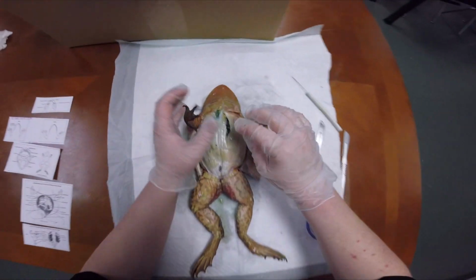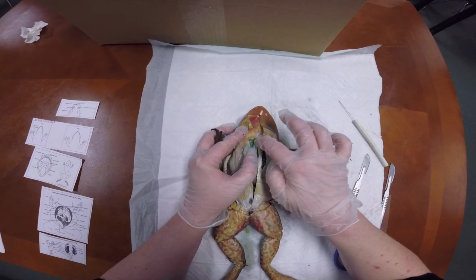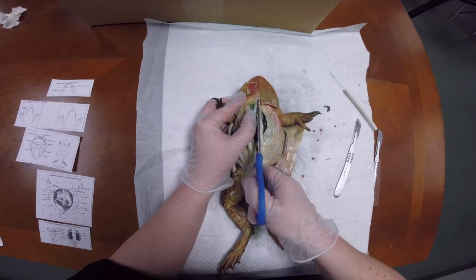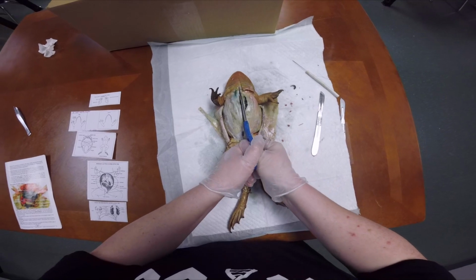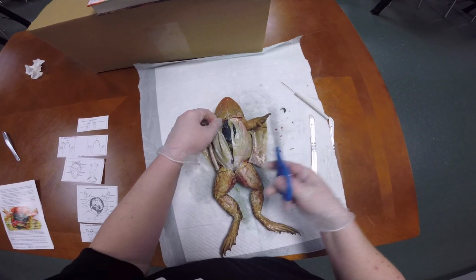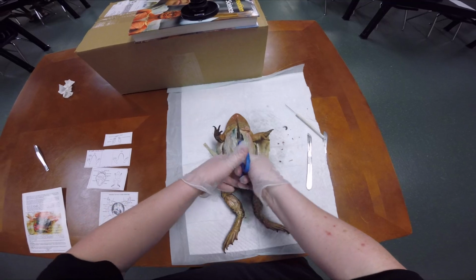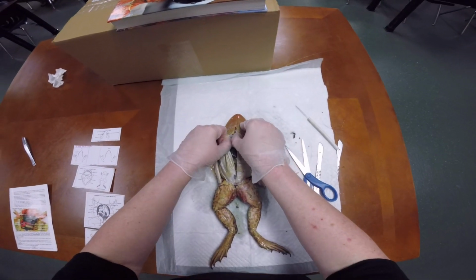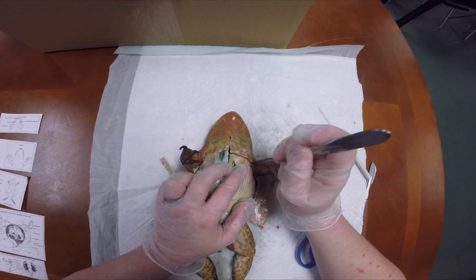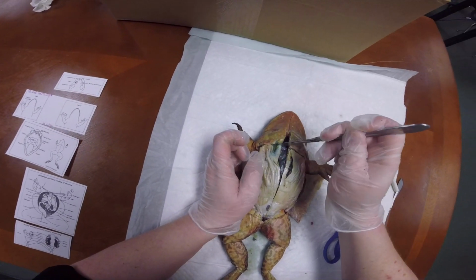Now, here's the part that is the most fun. The breastbone is right here, and you have to cut through it in order to see the heart. So what I do is I stick my scissors in there, and I bring it up all the way and I cut through the breastbone. Okay, and so the breastbone has been cut. I'm just going to cut up a little bit further into the lip, and that'll give us a bird's eye view.